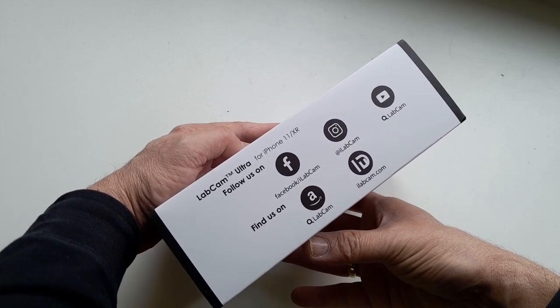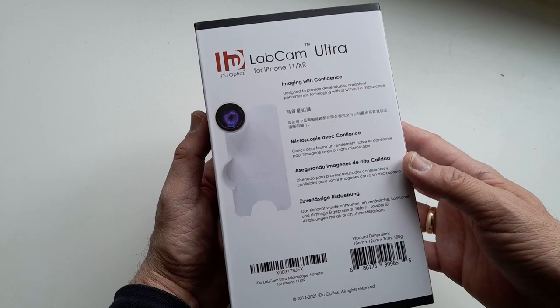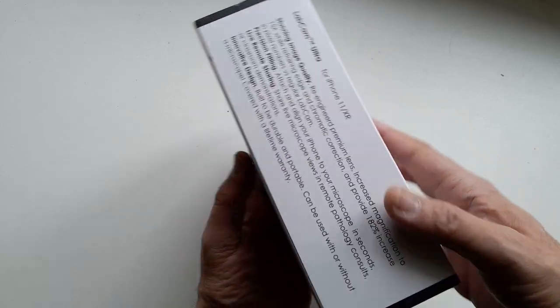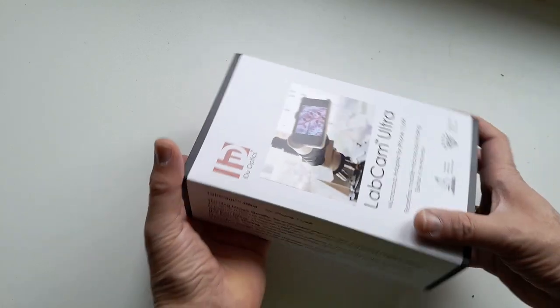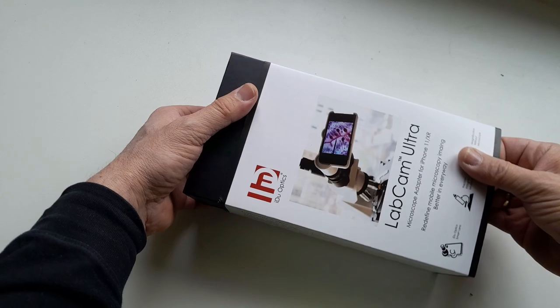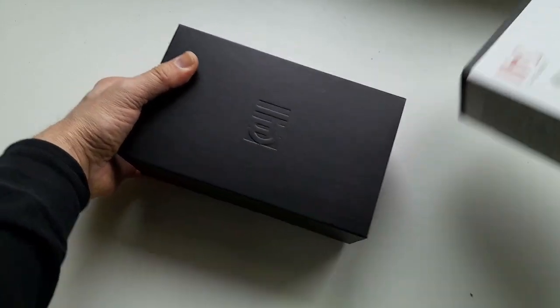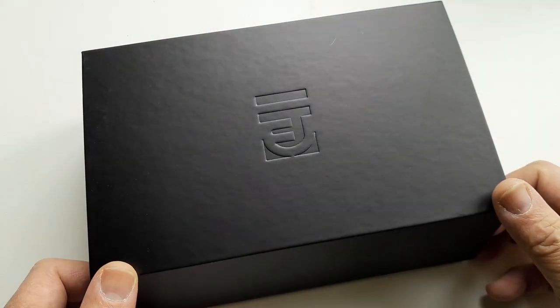So let's start unpacking the adapter. It comes in a very nice box here, it is the box of course there are also some links to social media sites on the box and some general information. The box is of very high quality, as a matter of fact it does even contain a magnetic lid so it allows you to repeatedly store away the adapter without any problems.